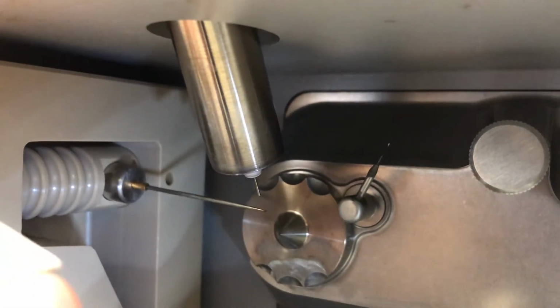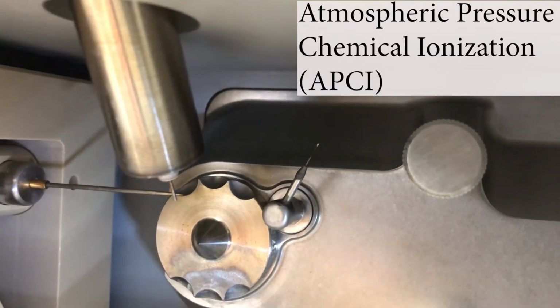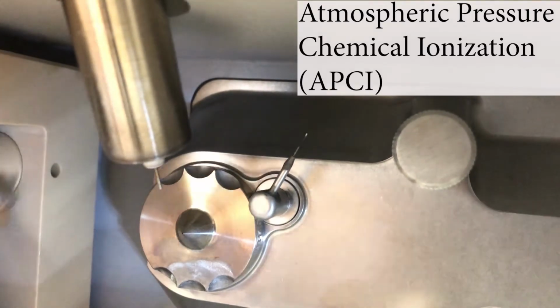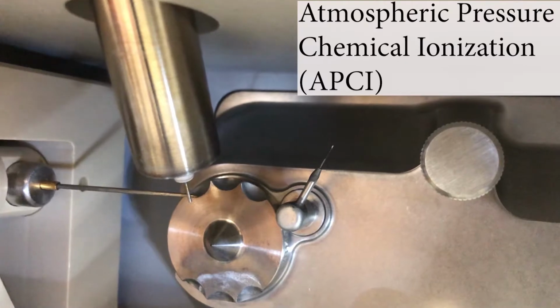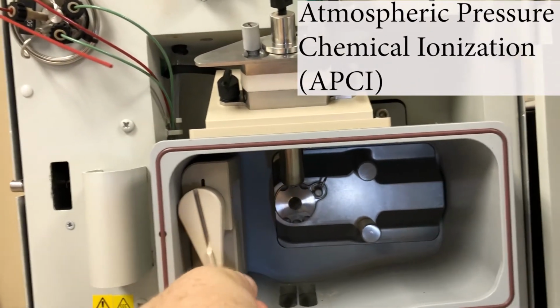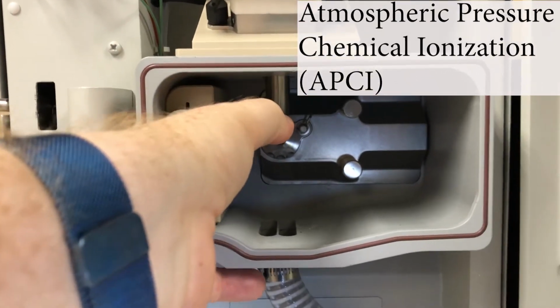So there we go. We flip that needle up. Now that needle is kind of pointing there between the spray and the inlet. And if we change the voltage, and change a little bit in the software, we're now doing atmospheric pressure chemical ionization, or APCI. So if you have electrospray, you usually have an APCI accessory. It's a nice, simple transition, and almost all LCMS instruments have both sources attached to them.